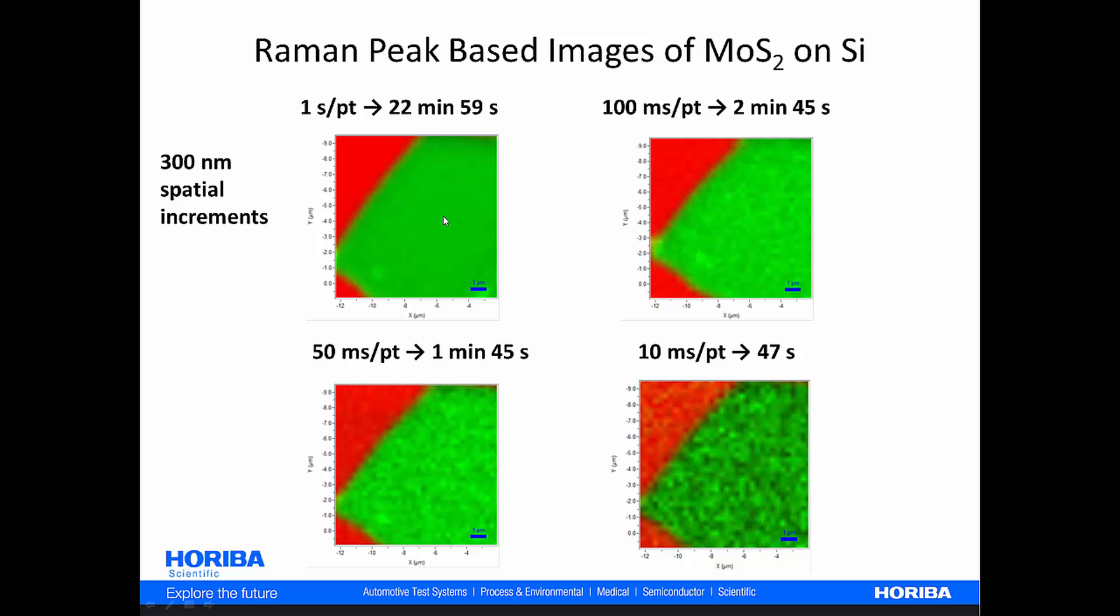And so what I hope you can see here is that in moving from one second per point at a total of essentially 23 minutes of integration time to a tenth of that time, two minutes, 45 seconds, where you go to 100 milliseconds per point, down to 50 milliseconds per point, you can really cut your times and still maintain pretty decent imaging. And finally, at 10 milliseconds per point, we're starting to get some fairly grainy image, which is consistent with the signal to noise of the spectrum.